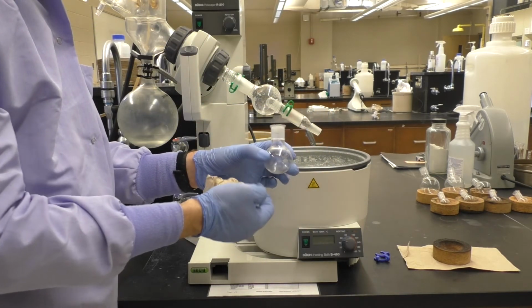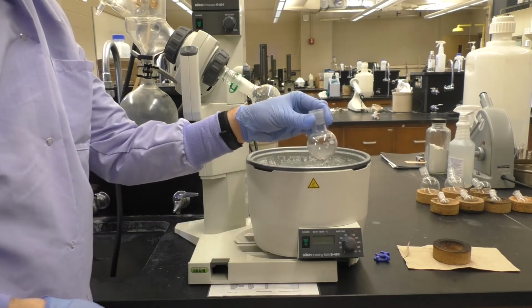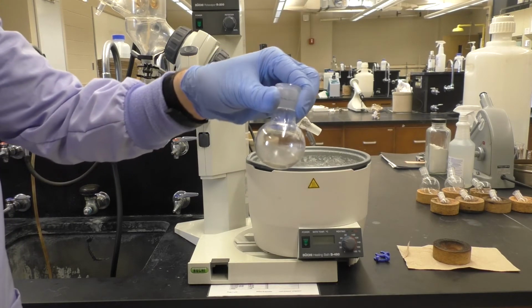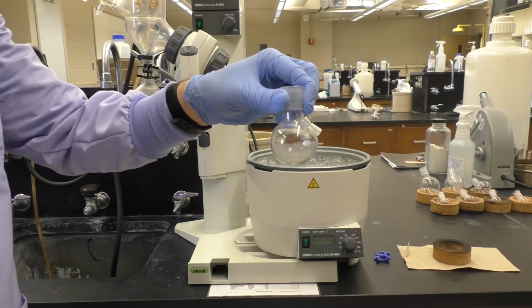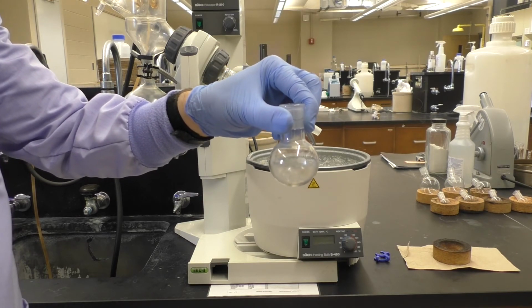And what you probably cannot see is that although we've removed all of the solvent, there's still a trace amount of oil here in the bottom of the flask. That should be our product. We'll go to the balance and get a final mass for that, and then prep an NMR sample for NMR analysis to confirm the purity of our product.